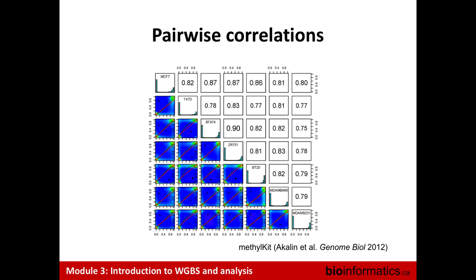in correlation. So once again, you have values of various CpGs of different methylation value. This would be to look at the correlation between different pairs of samples, and depending on whether they're replicates of the same thing. I don't remember what ENCODE expected with replicates in terms of correlation, above 80% or something like that, I think. Again, the higher coverage you have, the more accurate your methylation levels will be. And you can sort of play with this.